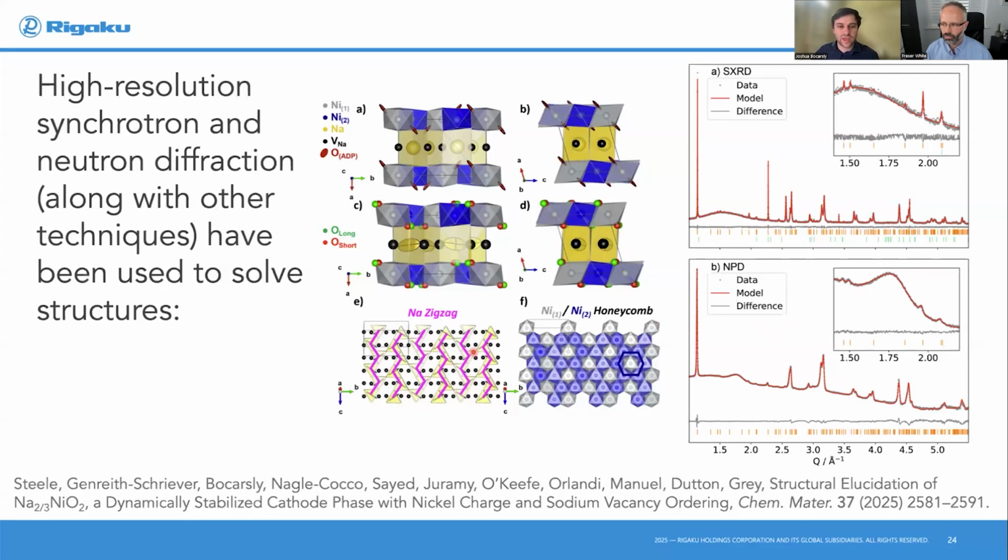But the structural model it came up with shows the sodium zigzag ordering quite nicely, and also finds out from the ADPs and different forms of modeling that it's a very dynamic structure, and that a lot of how the battery performs is probably related to how dynamic the vibrations are as the battery starts to be charged, which is quite interesting. Okay, so that's very beautiful work, but as you can see, it's very labor intensive. You need access to national facilities and it's quite challenging.